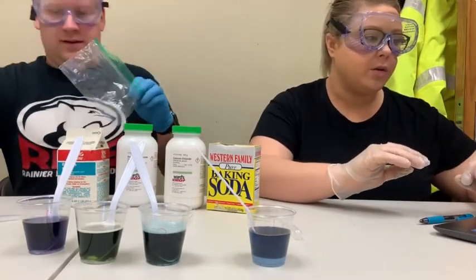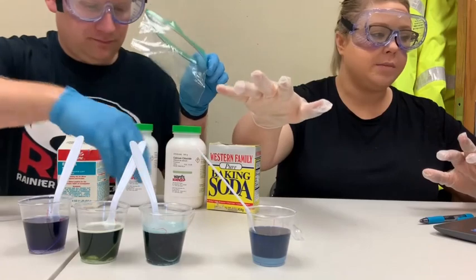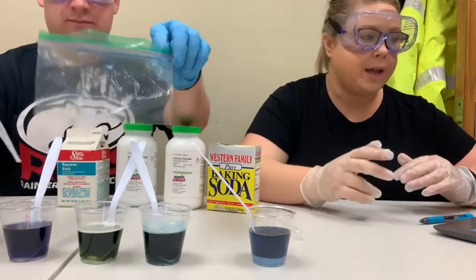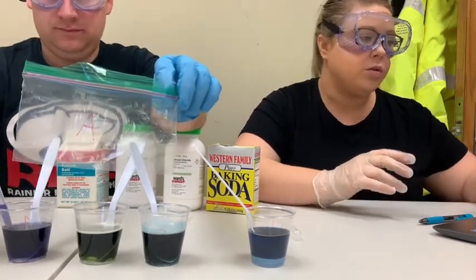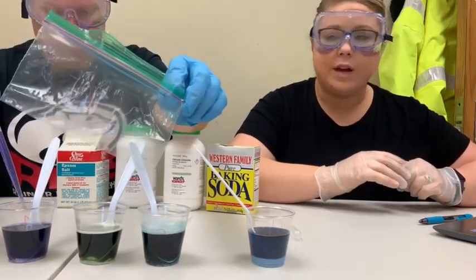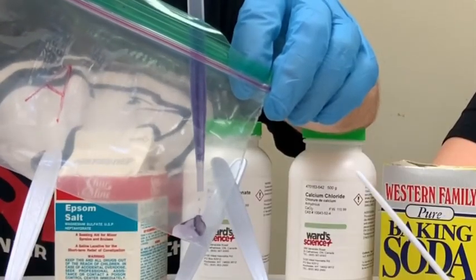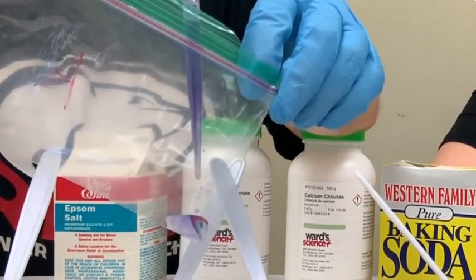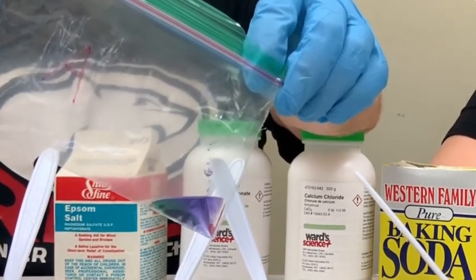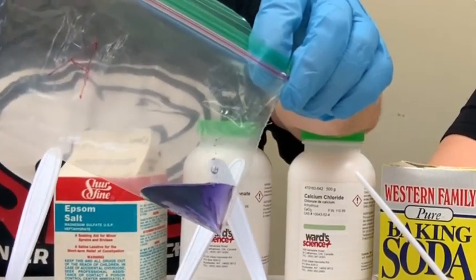So for the second part, we are going to be mixing some of these chemicals. So the first one is the magnesium sulfate with sodium carbonate. So we have a plastic bag labeled A, and we're going to use the pipette to add 3 droppers full of the magnesium sulfate to bag A. 3 whole droppers full? 3 droppers. Oh, good clarifying. That's why you have the instructions with it. Yep, 3 droppers. That will also make it more visible.